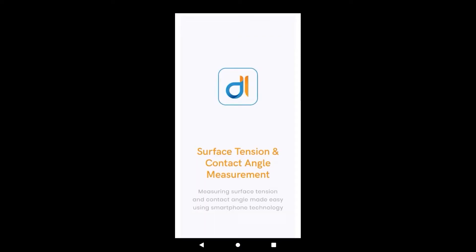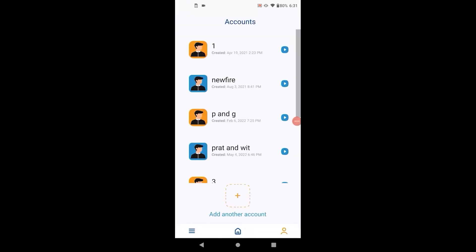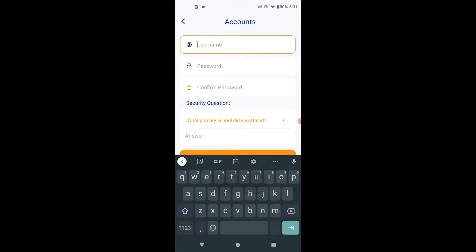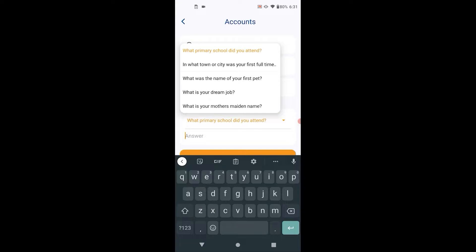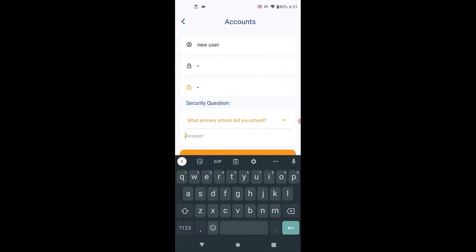This is an instructional video on how to use the Droplet Lab Surface Tension app. First we create a new account, choose the username and password, confirm password, and security question for password recovery.